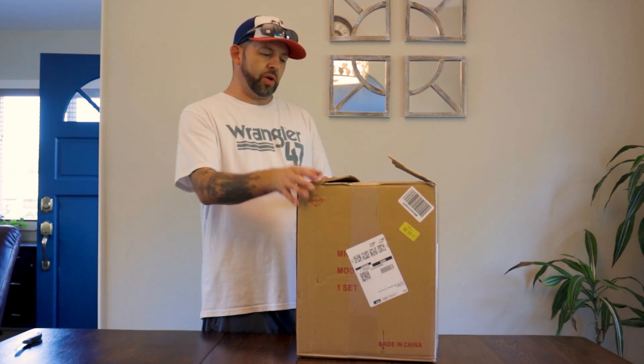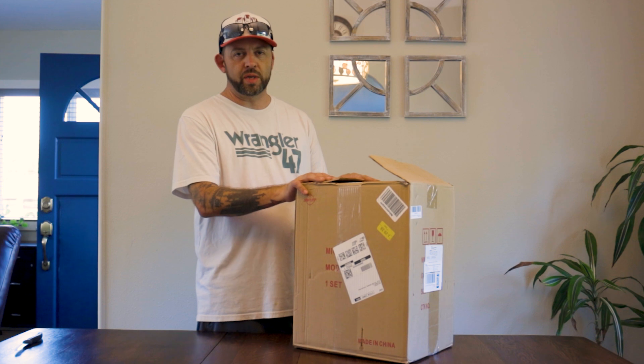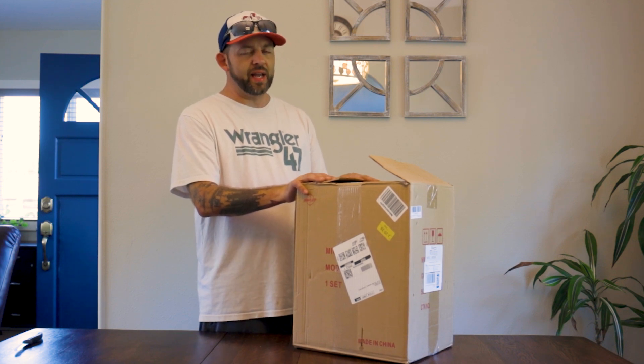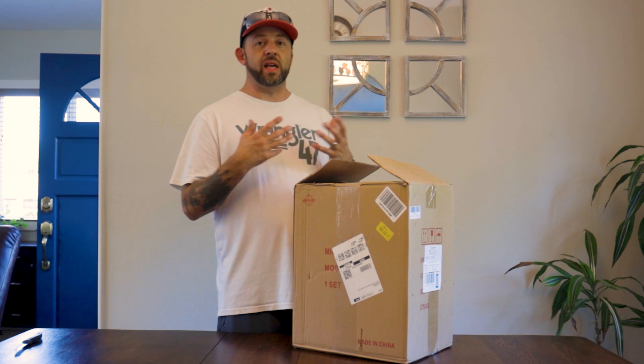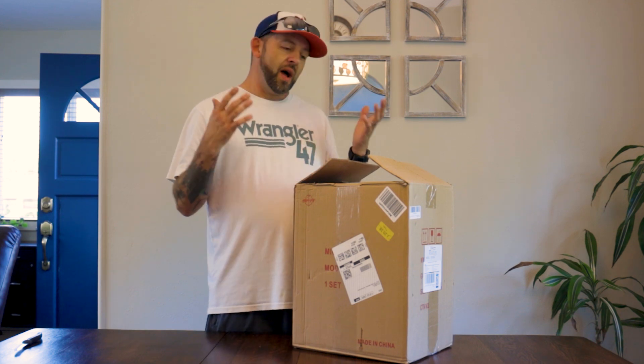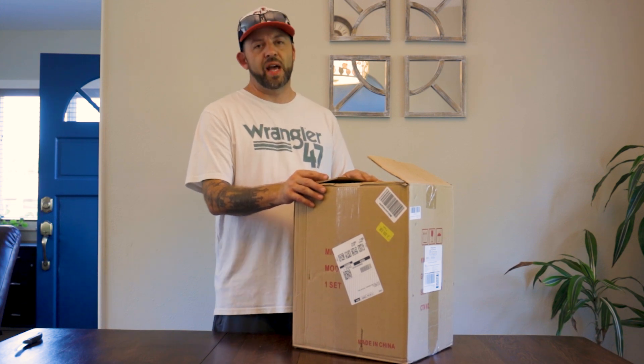We'll even look through the lens and see how well it looks at some mushroom spores. Just to give you an idea — if you're entertaining the idea of getting into microscopy and taking your interest to the next level, a microscope is the way to go. This was like $280, on my front door the very next day from Amazon.